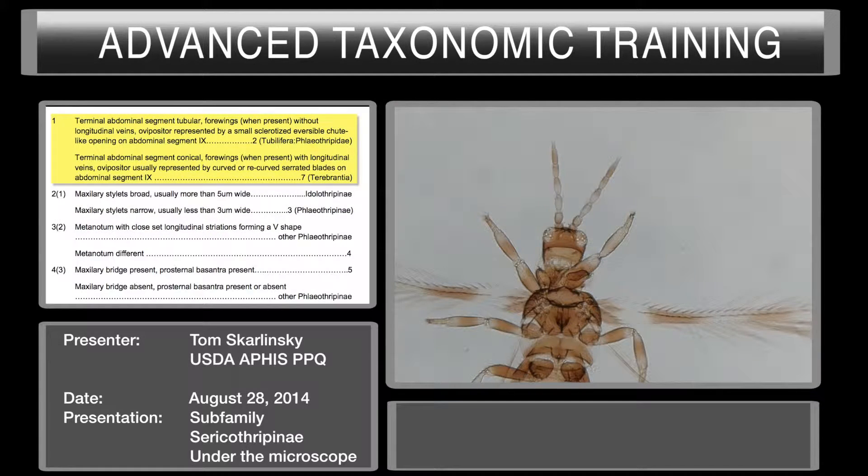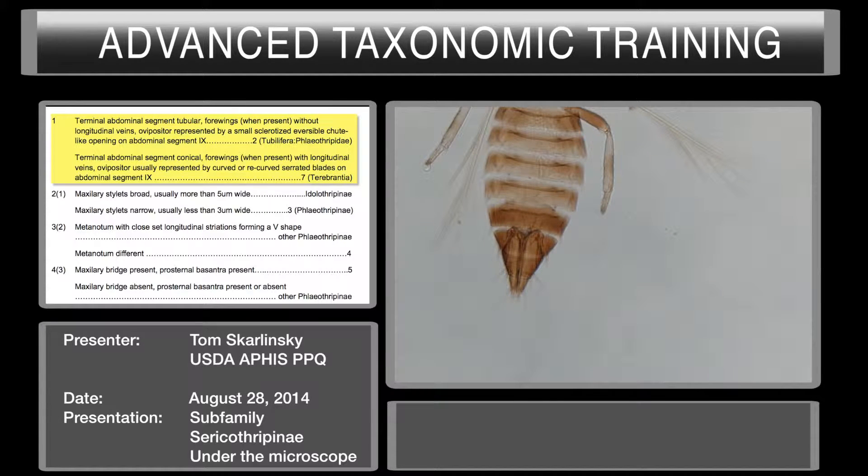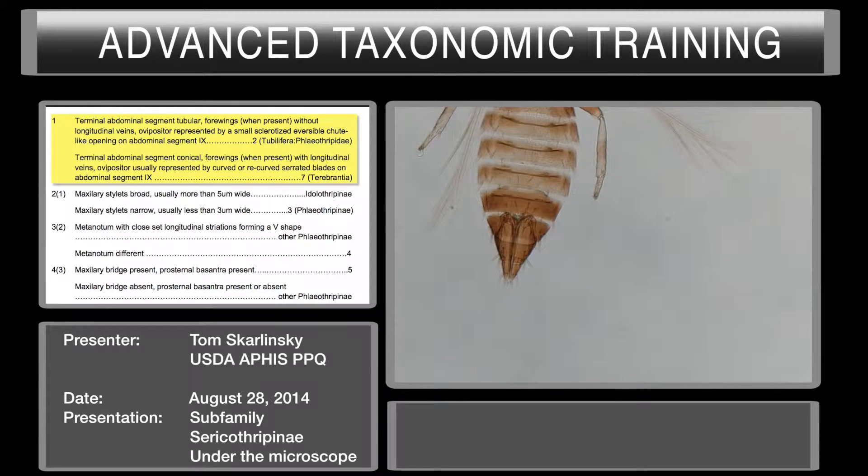They've dropped off another thrips, so we have to figure this one out. We're going to go to couplet number one. Segment 10 of the abdomen — does it appear conical, or does it appear tubular? My vote is for conical.